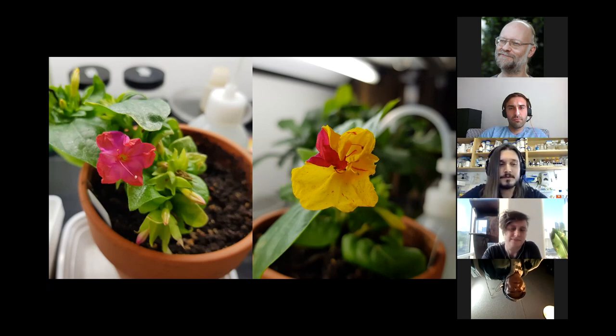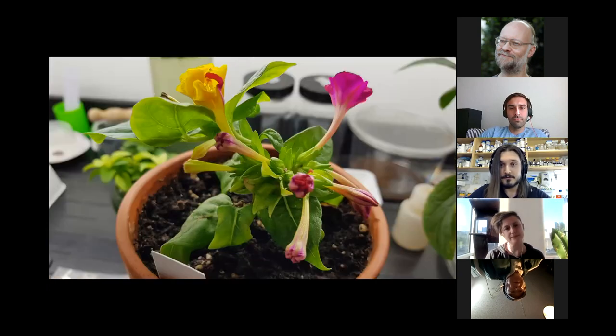But what I tried to do is do some tissue culture and incorporate a dCas9, which is a broken Cas9 that just binds to a sequence. I basically wanted it to shut up and just stay one color, if that's possible, right? So in my failings of the tissue culture and engineering of this plant that hasn't been engineered yet, I managed to get it to dwarf and do this. So those two images are actually on the same plant.